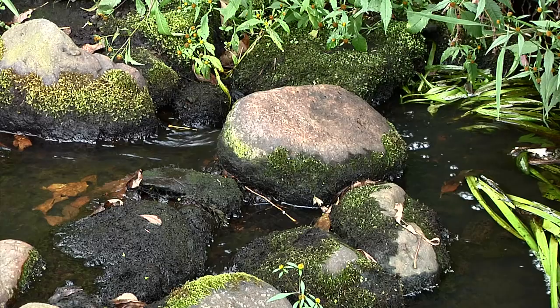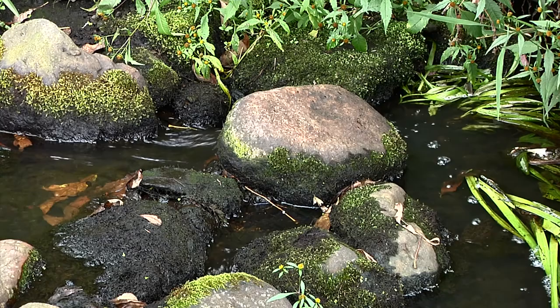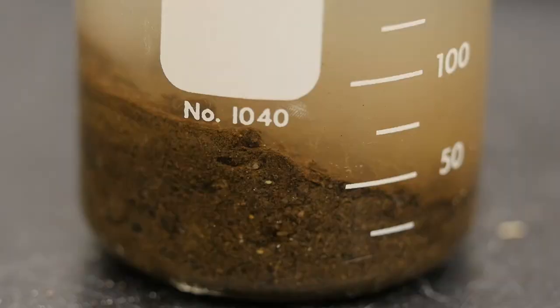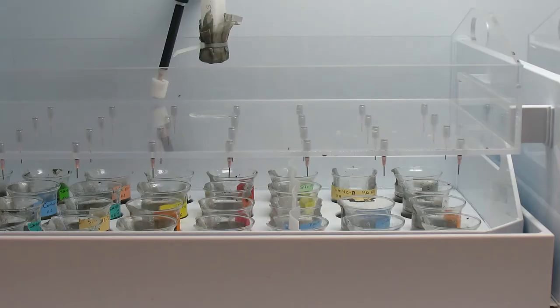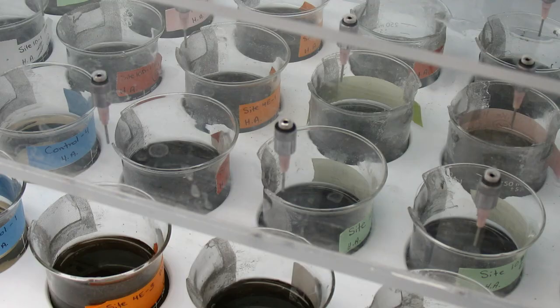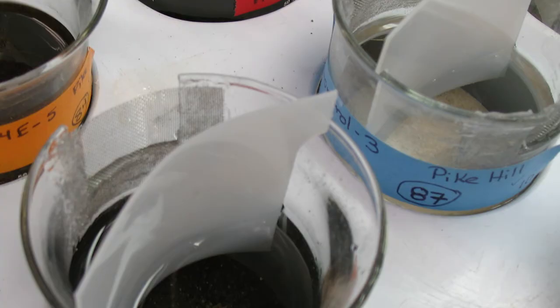It was really very high concentrations and we needed to do direct toxicity studies to see whether there was toxicity in Bliss Brook and how far downstream it extended. And we did that looking at the sediment at the bottom of the brook and also surface water. We did toxicity studies on both.